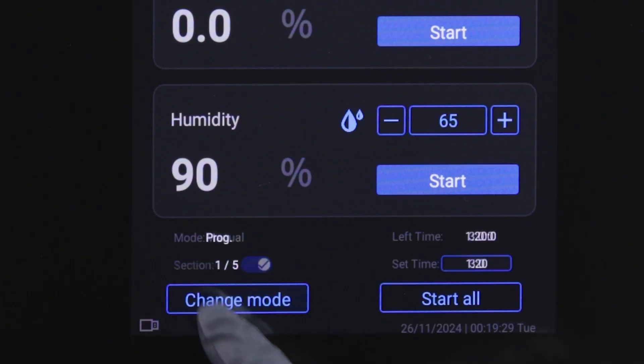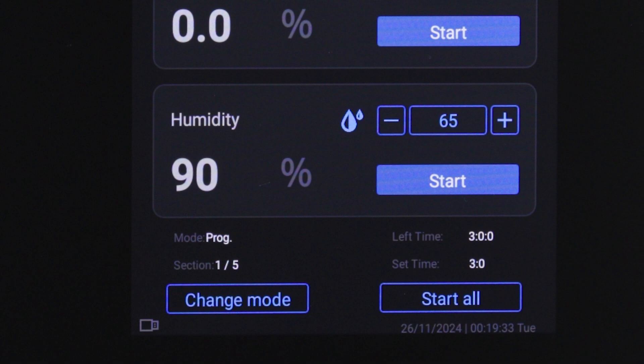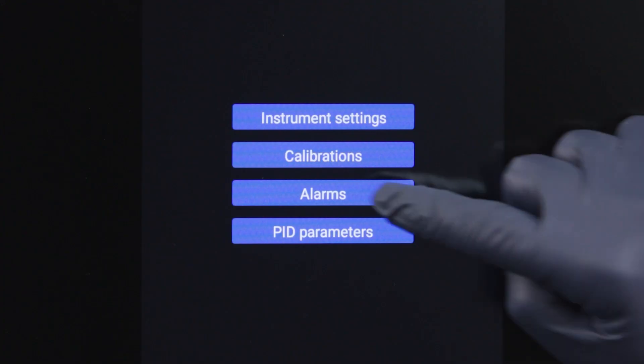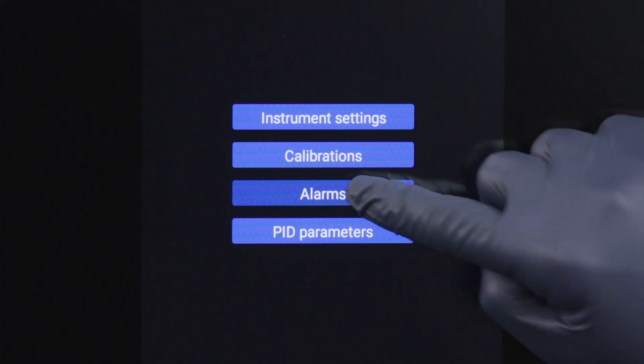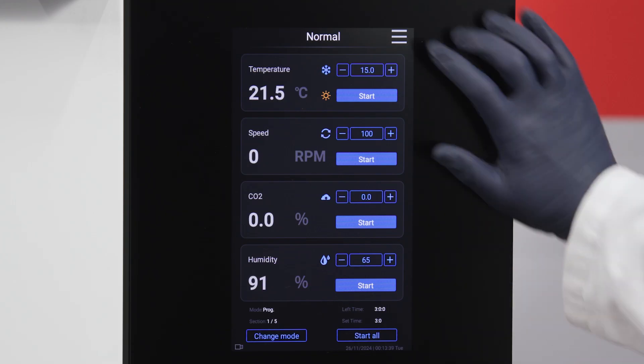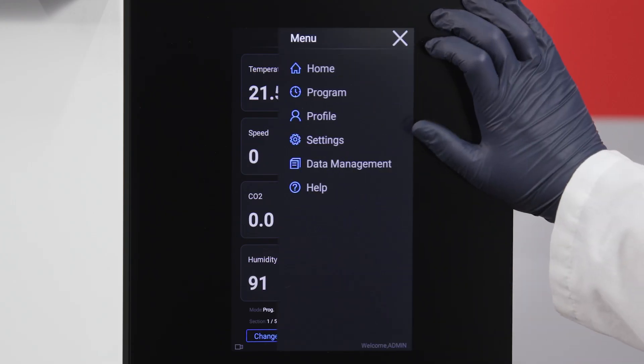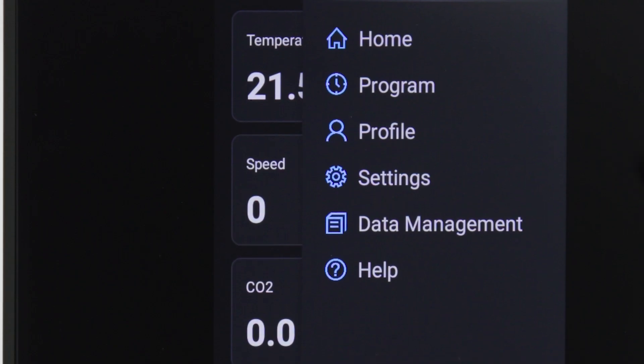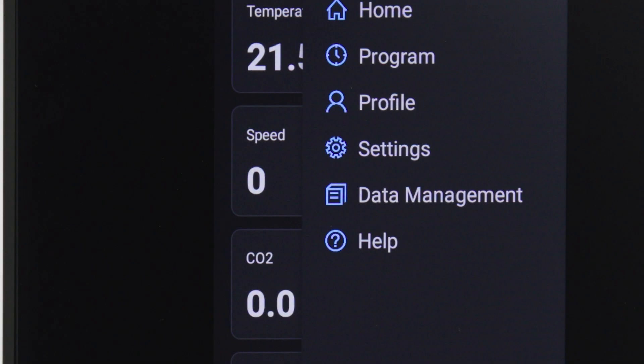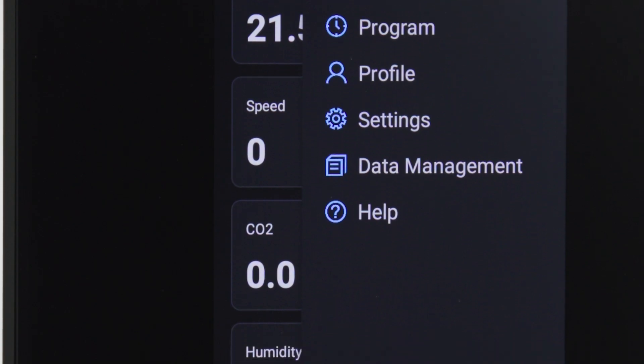We'll discuss using the touch program's manual and program modes and talk about alarms that can help keep your shaker operating smoothly. We'll also review the types of information and options you can access through the menu navigation.